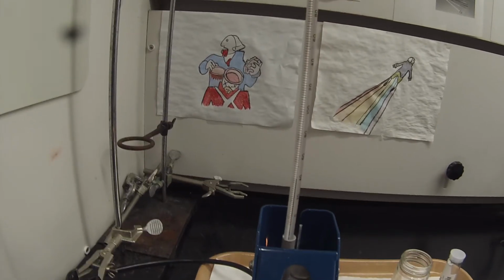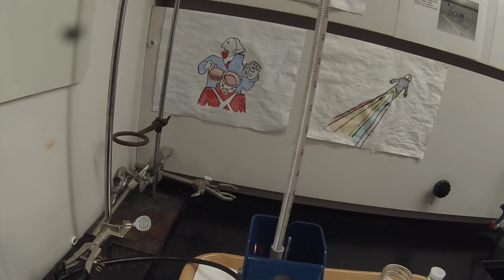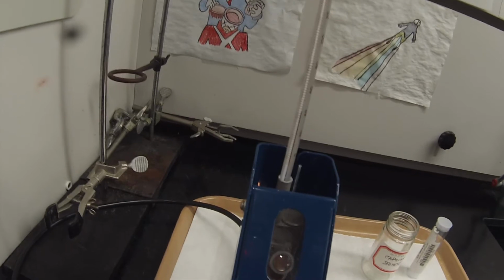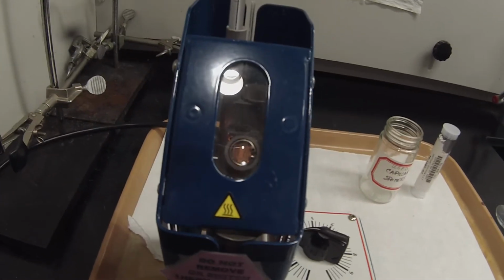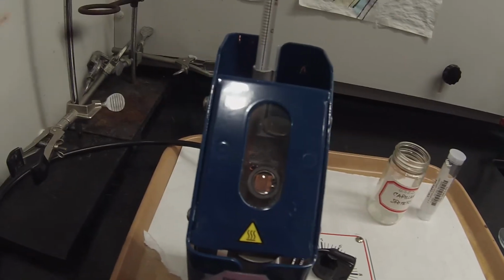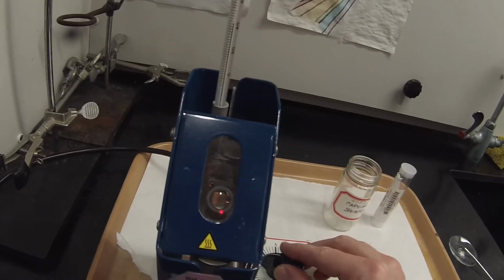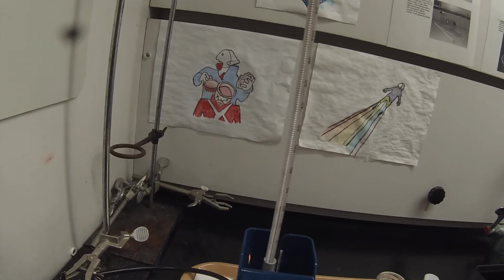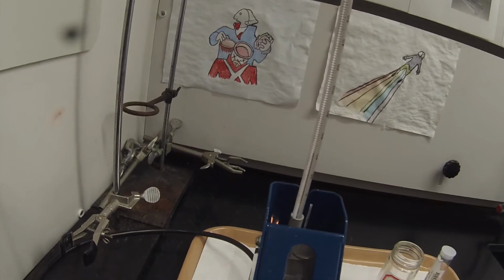Now we're up around 40. It's rising at a pretty decent rate for that lower melting point. Obviously I could be rising a lot faster if I knew that I had a higher melting point, but I don't know that. So I think I can raise this to 4. At this heating rate, even for that lower melting point, we should be in good shape. So we're at 42.